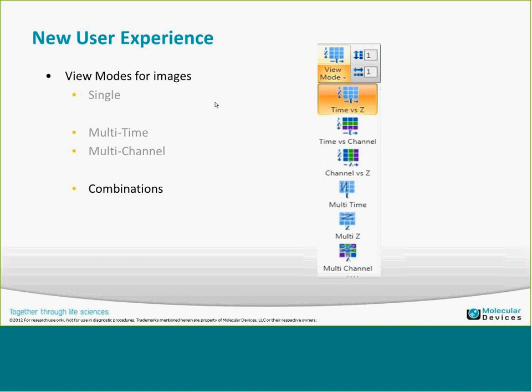The 4D viewer lets you open a dataset in a volume display with orthogonal displays, and you can adjust the view angles for each plane. For window management, you can dock and auto-hide specific panes — like the configure illumination or magnification panes. Change the pin to auto-hide, and when you're ready to use it, click the tab to slide it back out, then slide it back when done. This keeps a clean desktop.